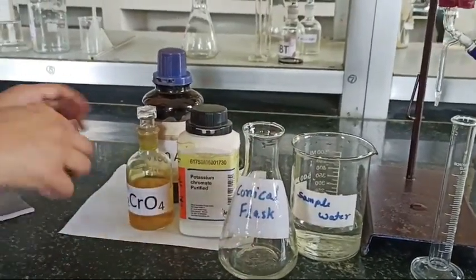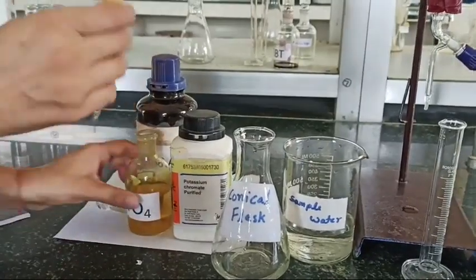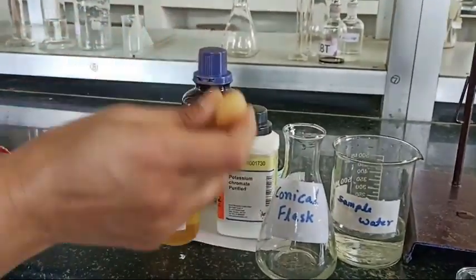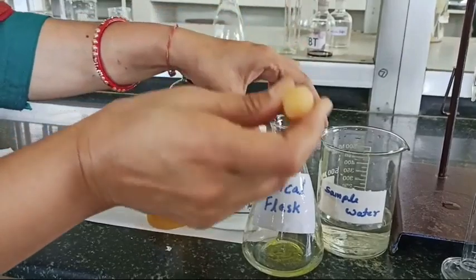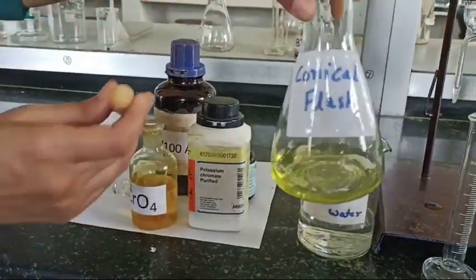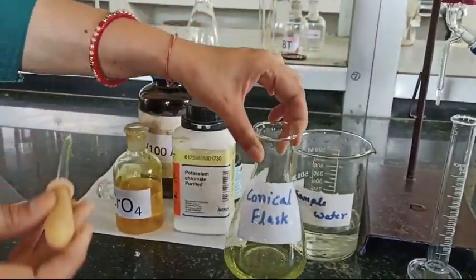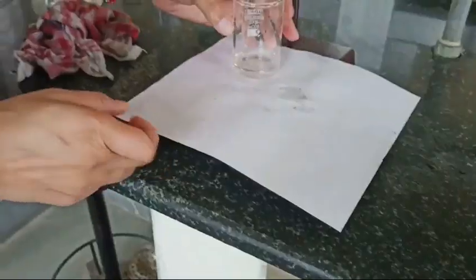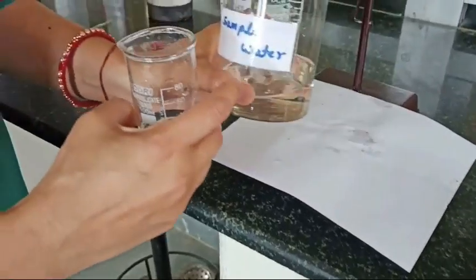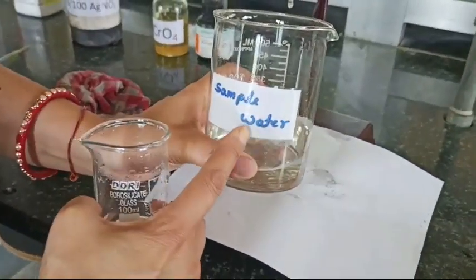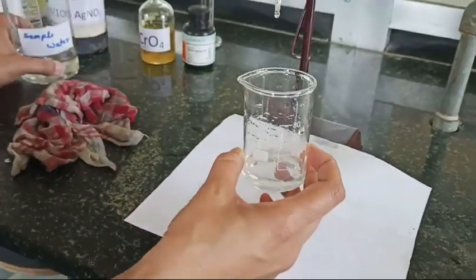This AgNO3 was first standardized with the known concentration of NaCl solution. So those who are doing all the experiment by themselves must understand standardization of the known compounds before titrating it.